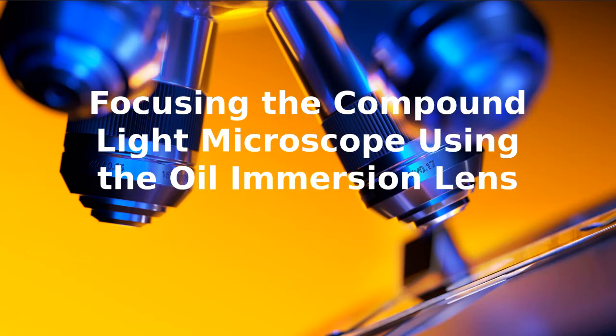That's kind of a refraction problem. And so that's the same kind of problem we're going to have here with this microscope lens, this 100x objective, this oil immersion lens. And so we correct for that refraction by adding a little bit of oil, and that corrects it. So you'll be able to see things clearly.